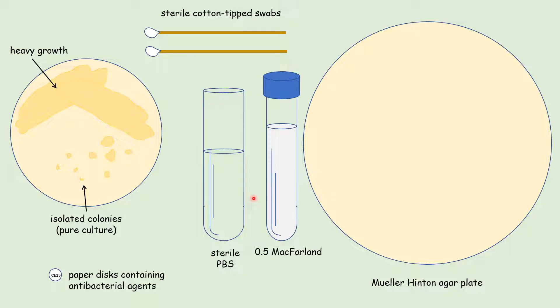We will need a container of sterile phosphate buffered saline, or PBS — we can substitute this with normal saline if needed. We'll also need a 0.5 McFarland standard tube. This tube is special because it has barium sulfate and has a certain cloudiness that mimics a tube containing bacterial cells. The turbidity matches that of a tube with 1.5 times 10 to the eighth bacterial cells per mL, and that's the concentration we're going to try to reach.